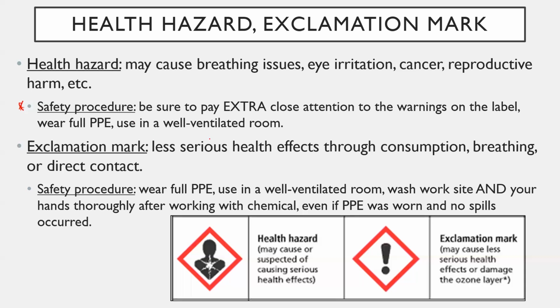Wear full PPE, and a really important one, use in a well-ventilated room. So if possible, even use it in a fume hood where the fumes can be sucked away and out, or at least open some windows. Again, we won't really deal with anything like this, but it is still important to know.